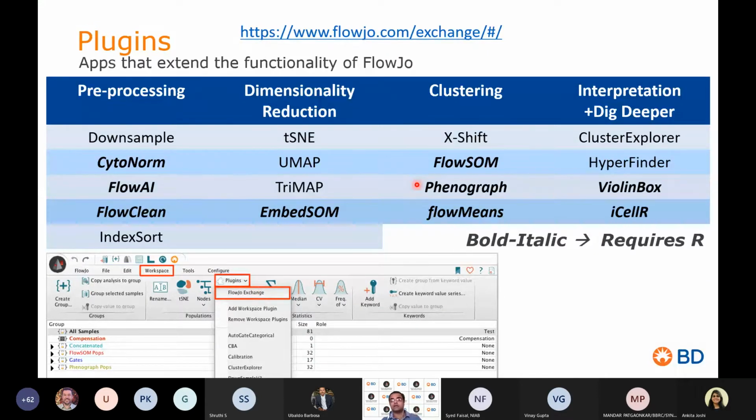And depending on the version you have, like last session, Tim showed through a presentation how you can use the FlowJo Plugin Wizard, which is a very new tool that helps you get all those updated versions of all the plugins that are required on your PC, customized for you.